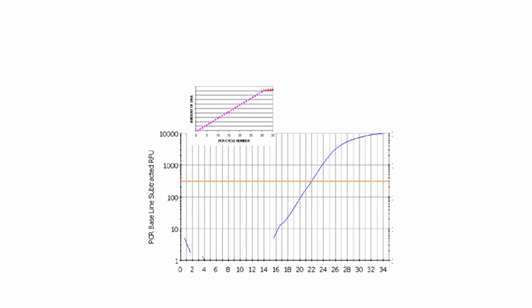And if we were measuring this in a piece of equipment, there would be a level below which you would not be able to adequately see anything on a gel or an instrumentation because you simply did not have enough copies. But then in the exponential phase, at a certain point, it would cross a threshold, and then you would be able to start actively measuring the amount of PCR in your sample. But then it runs out of steam, and in an endpoint PCR, this is the point at which you're measuring it right here, not while it's actively growing.